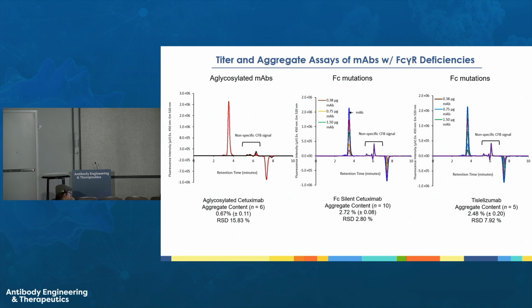We did. Actually, we took the extracellular domain of PD-1, which is a very important anti-cancer ligand, and it was labeled with a fluorophore, and you get a fluorescent peak for PD-1.